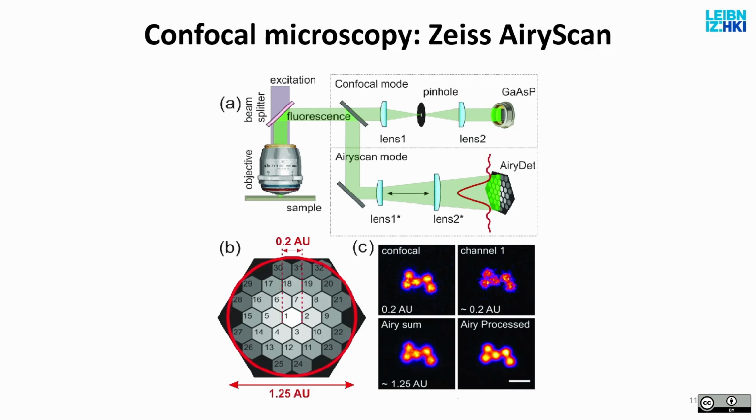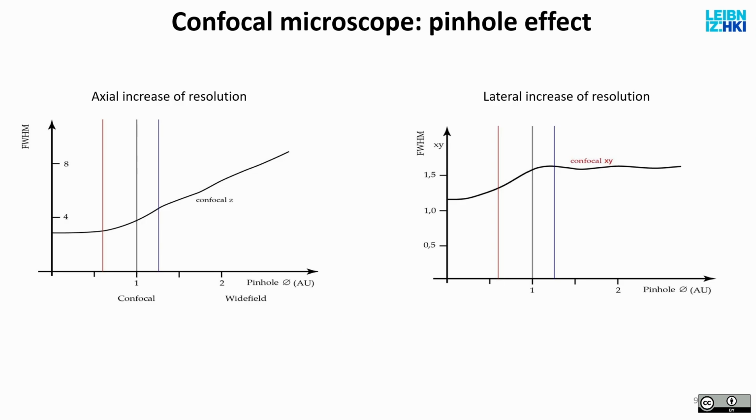But this, like I said, linked back to this curve that I cannot measure at 0 pinholes, so I need to measure this curve along various pinhole values. And what I don't want to do is take the same image with each pinhole. What I have, 1, 0.7, 0.1, it takes forever.